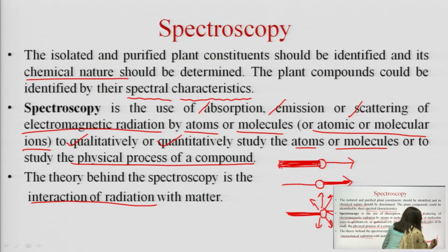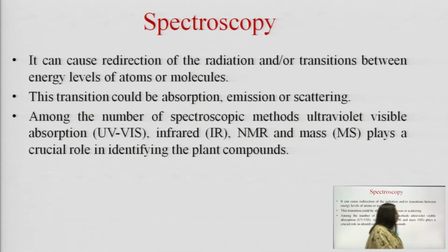So, this is the inward scattering effect and this is the outward scattering effect, and this scattering takes place owing to the nature of the atom present in the sample, or the molecule, their ions, or any other physical process involved there. So, this technique is utilized both to analyze qualitative and quantitative parameters of the analytes.